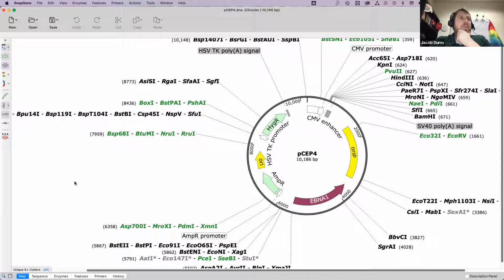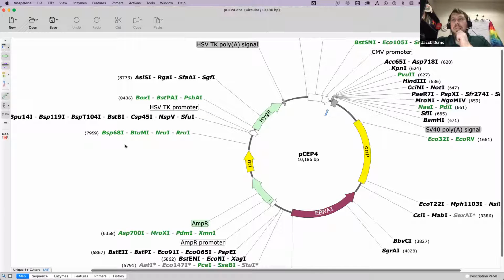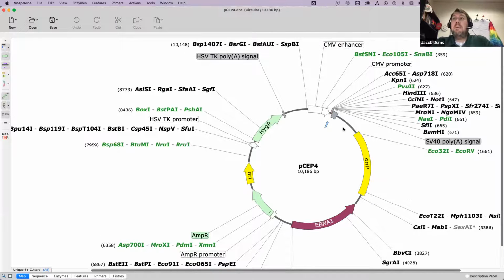One of the things I'm going to also do now that the words are a little bigger is toggle this button. You can see where all of these annotated boxes right now are hovering above the DNA sequence. I like to just place them on the plasmid. It kind of simplifies the diagram for me. The nice part about that is oftentimes it also allows some of your features to bloop back into existence.